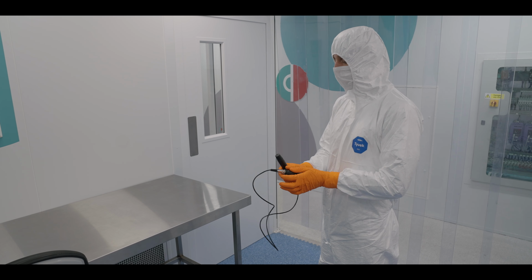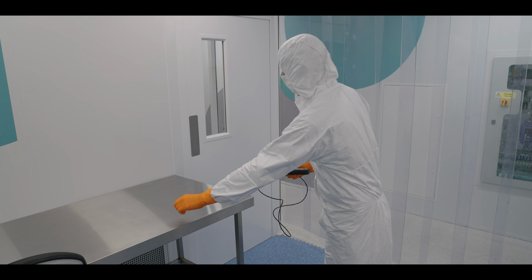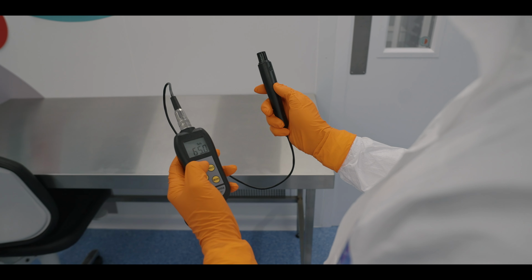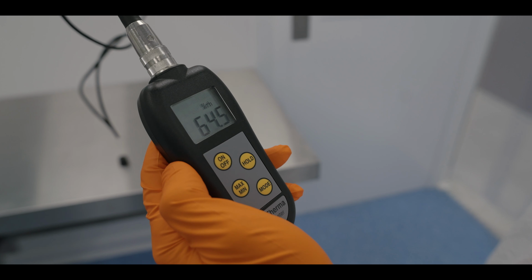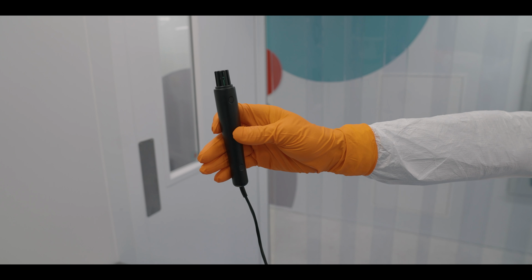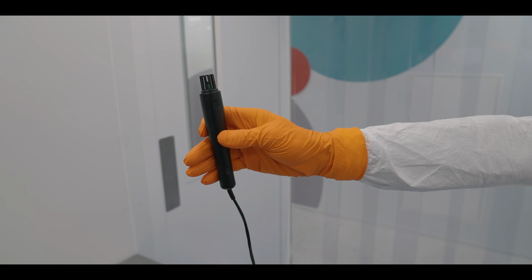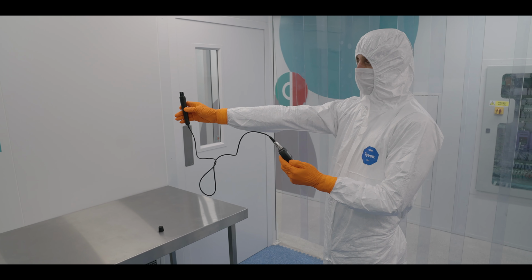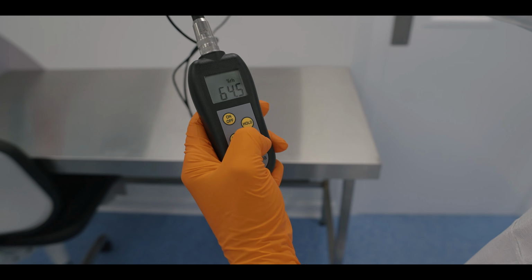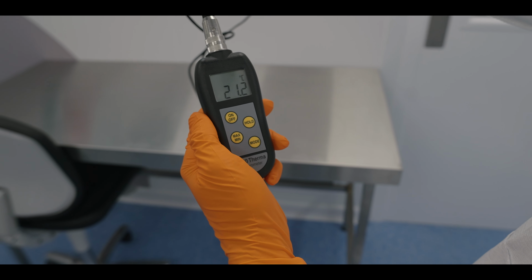In this next test we are looking at temperature and humidity testing. Temperature readings within a cleanroom can vary based on its purpose and the products being handled. However, this range must incorporate personnel comfort and prevention of contamination. Relative humidity is also crucial for preventing bacterial growth, employee discomfort, static discharge and potential damage to sensitive materials. A multifunctional hygrometer is often used by leaving the device within the cleanroom for a specific time to collect the temperature and humidity readings simultaneously.